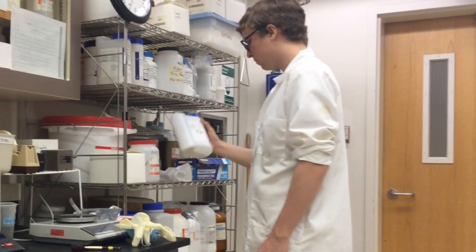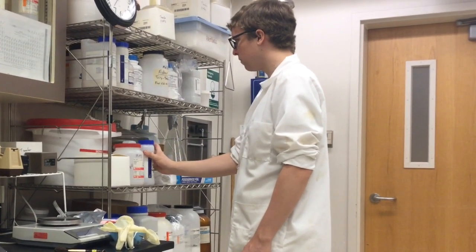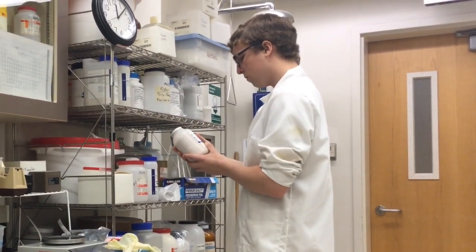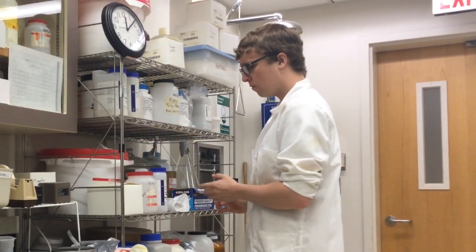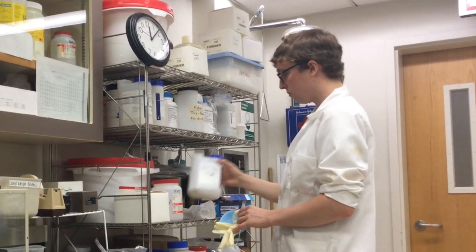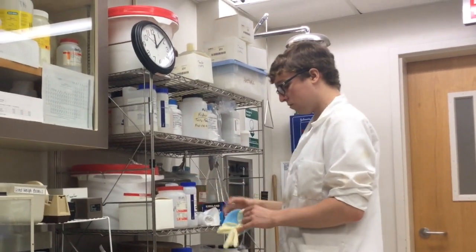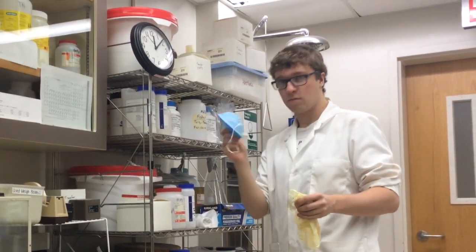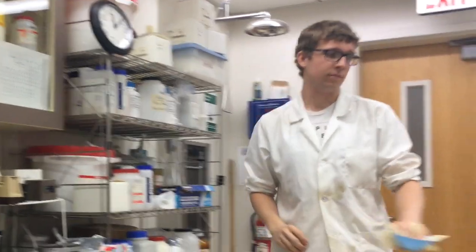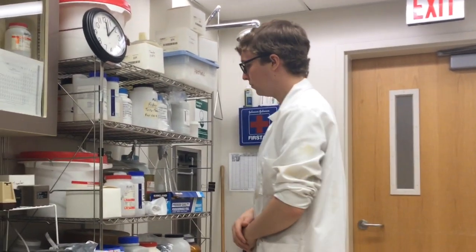Before we begin, let's go over some safety precautions. When working with chemicals, it is important that your skin and eyes never come in direct contact with them. When working with dangerous chemicals or light powders that may become airborne, it is important to take proper precautions by wearing gloves or a mask. In this case, we are just working with sodium chloride, which is the equivalent of table salt, so we will not need to wear gloves or a mask.